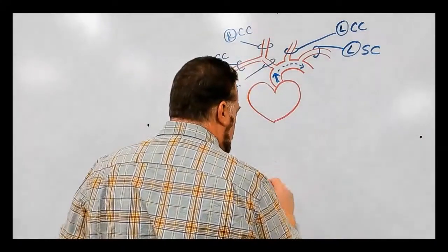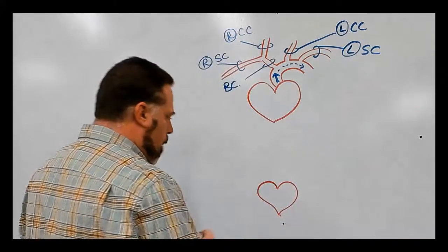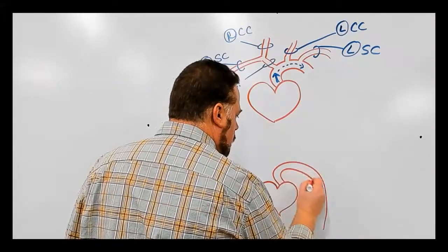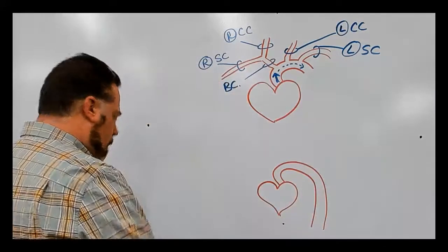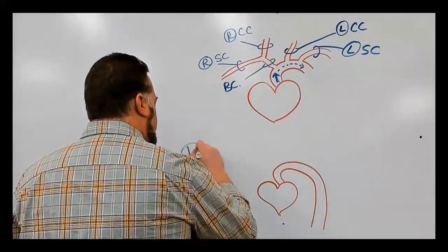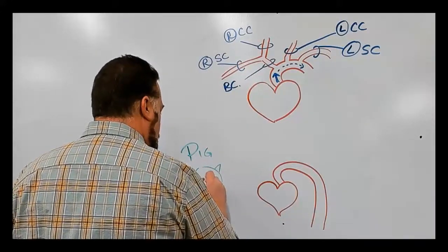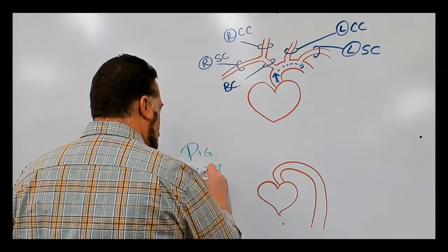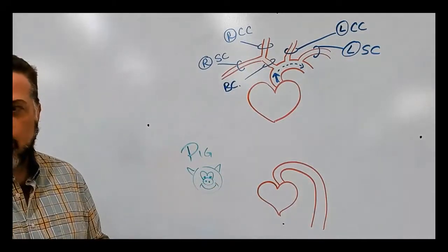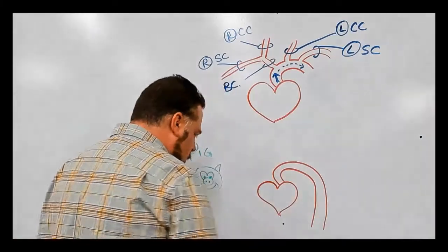Again, now I'm going to do the pig. We're going to have the same aorta, the aortic arch. Again, this is going to be the pig. Little pig. All right. So on here, this is what makes it a little bit different.